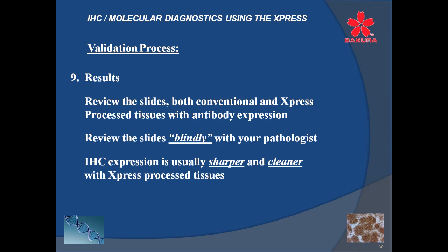Review the slides with your pathologist. If you're going to sit with them, you need to know which ones were Xpress process and which ones were conventional process, but don't tell them until you're finished. I know they think that's a little sneaky, but it really isn't. It's the best way of finding out what method is going to be the best that you're going to want to utilize in your laboratory.